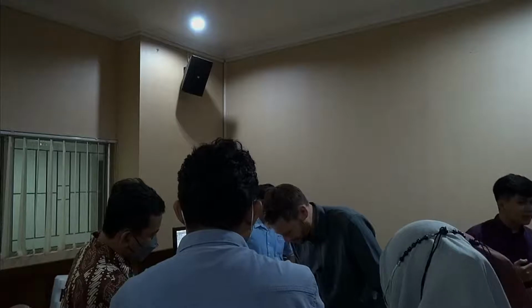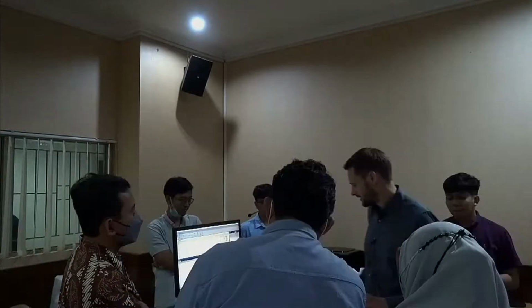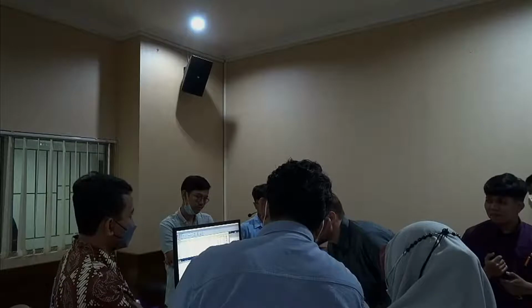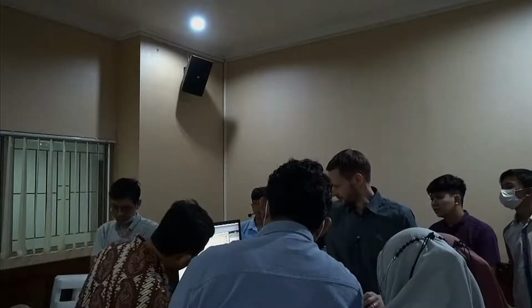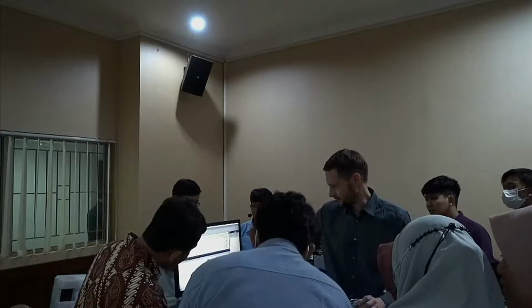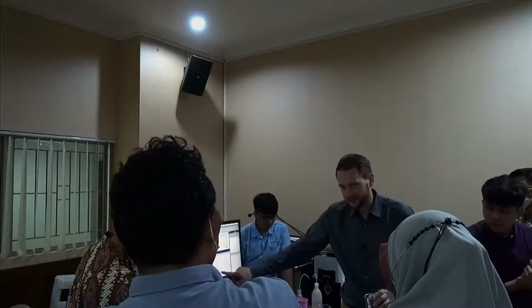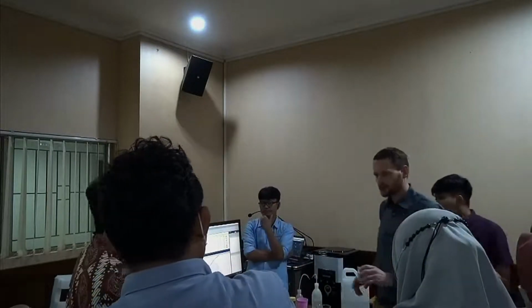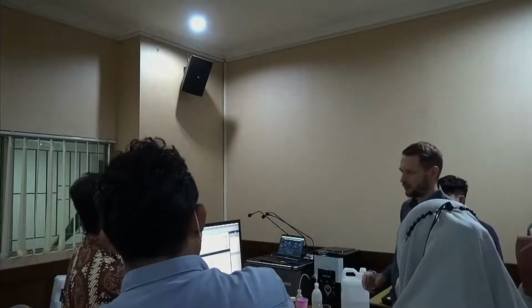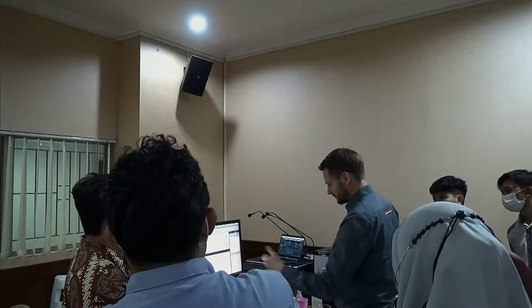So to be honest with you, to look at this, I actually thought that we will get a big shift from first, second, third measurement. It's not as big as expected, but you do see a shift. So especially, okay, the first two were actually quite stable, but the third one, the blue one, you see we observe a slight shift to the fine range. What is missing in the third measurement? You see here on the coarse part, there's something missing. So that is basically the ultrasonic still destroying agglomerates of clay, making them smaller. I actually expected it much, much worse, but still you see it's happening.